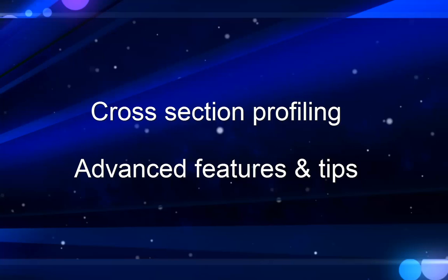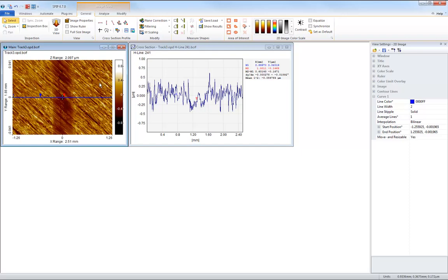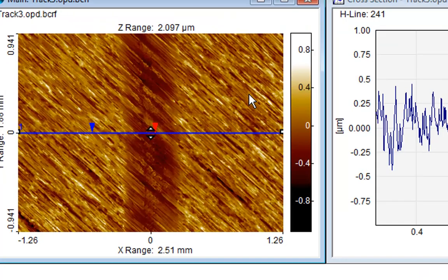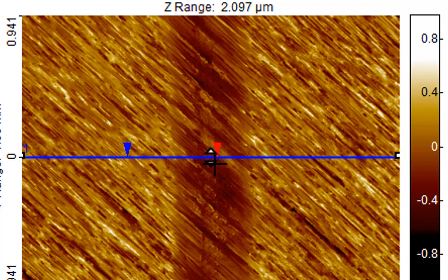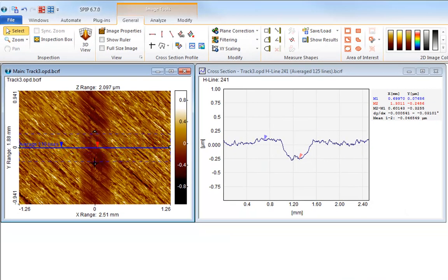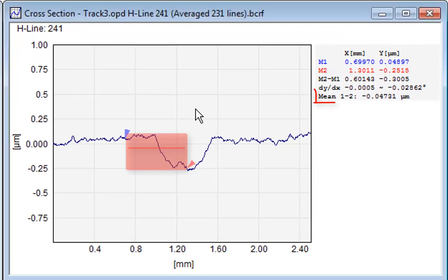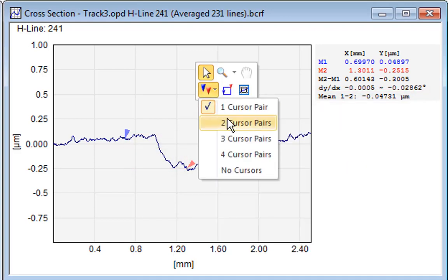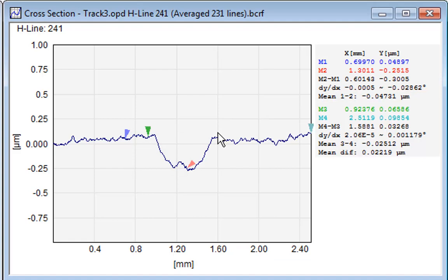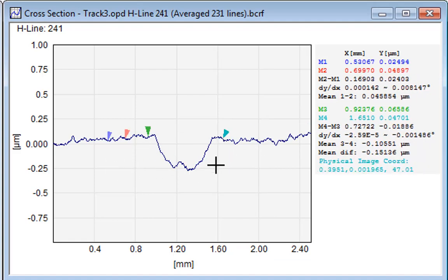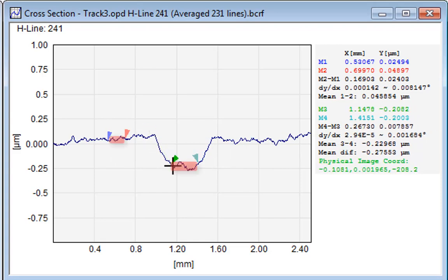Now to some more advanced features and tips. By pulling the small triangles in the middle of a profile, you can average the profile over several lines. This is a big help when measuring small step heights on rough surfaces. For each cursor pair, the mean value between the cursors is reported. For every two sets of cursor pairs, the difference between those mean values for the pairs is also reported. This is useful when trying to measure heights on rough surfaces.